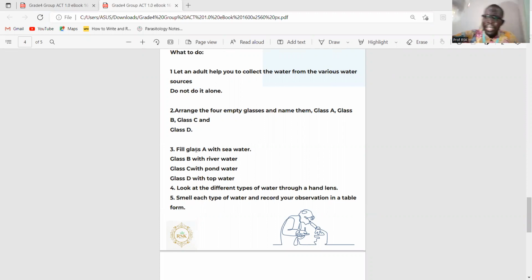That is a well water. Okay, some particles in it. If you also have your hand lens and you can't really see very well, you can use the hand lens to magnify the well water, so you can see it very well. So well water is also disqualified based on the particles in it.